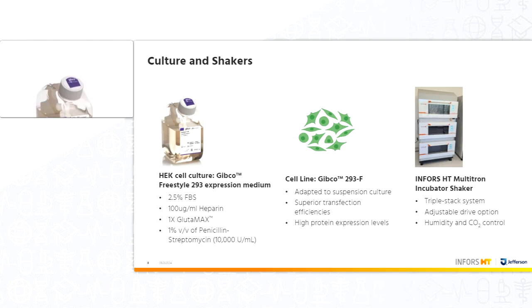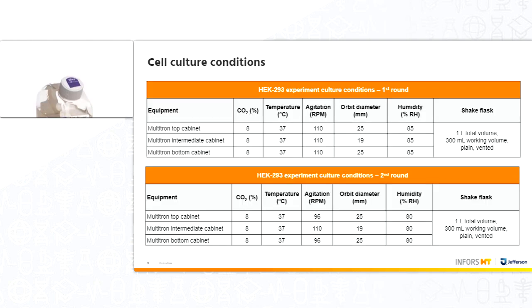And of course, the equipment. The incubator we used was the Multitron incubator shaker. It's a triple stack system. You can have an adjustable drive option, and you have humidity and CO2 control for each cabinet, if you want, at a different set point for each cabinet.